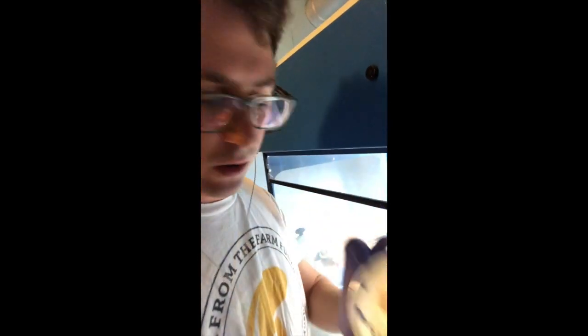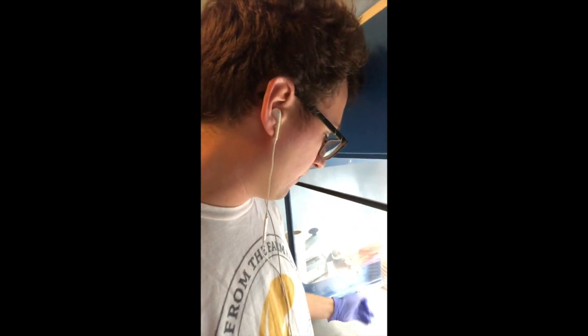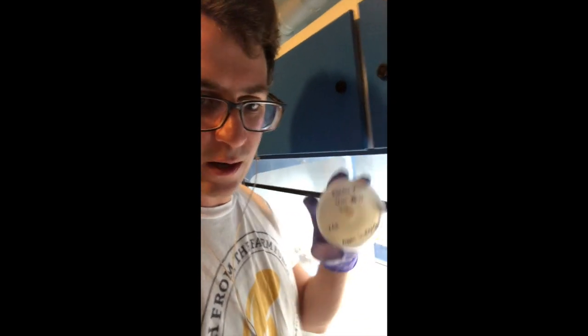We've got a local Colorado oyster from Jefferson County, then we've got another aspen oyster that was growing on cottonwood, and then we've got a flamulina species — a local enoki — that I'm going to be transferring onto agar. I'll just show you guys my process.